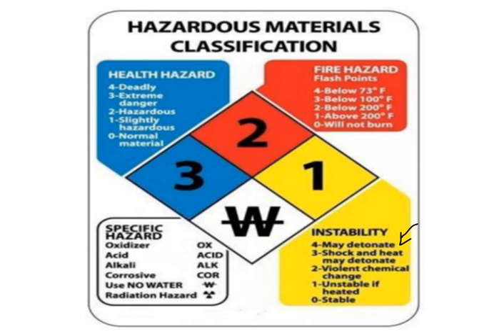Okay. And then this white category, there may be a letter in there to describe a couple of things, whether or not it oxidizes, is an acid, is corrosive, or like never use water on it. There's some chemicals you should never add water to. They're very dangerous.